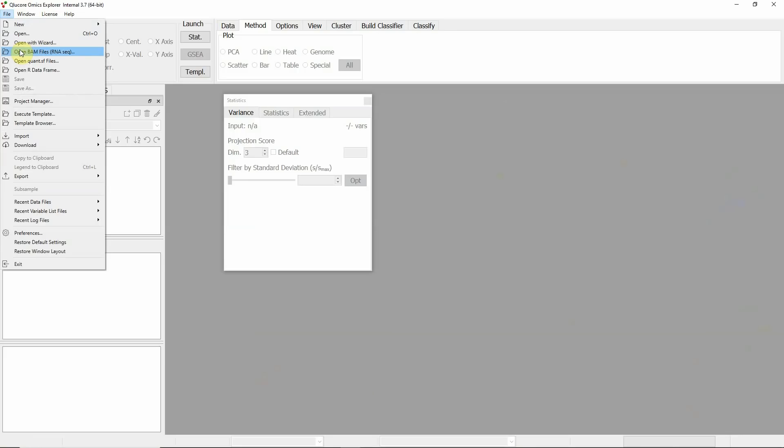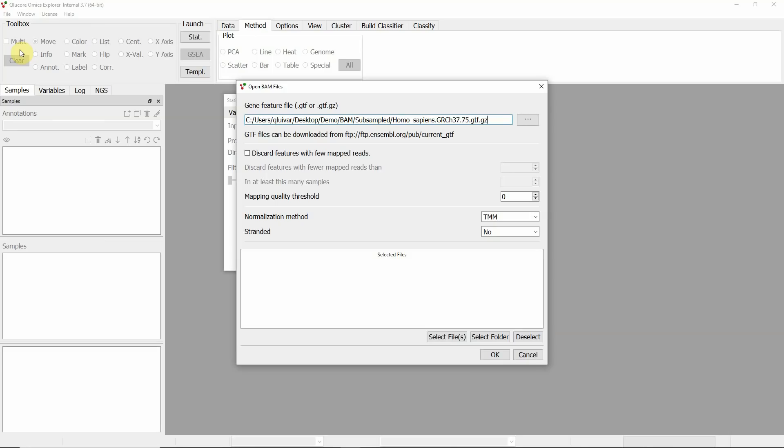First verify that it is the correct GTF file. This is indeed the correct one for this data. The next step is to define the quality and normalization parameters.